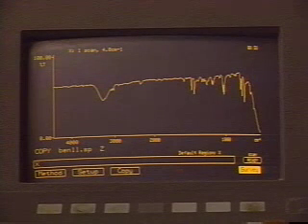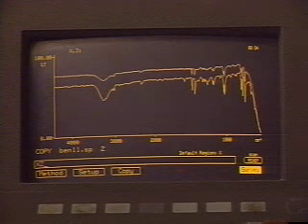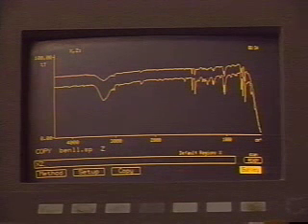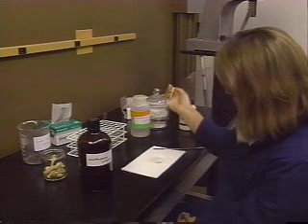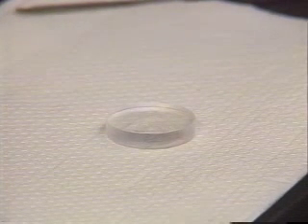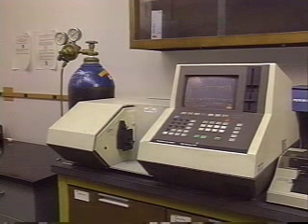This spectrum illustrates a proper thin solid film. If the concentration of the solid in solvent was too low, a spectrum with low intensities would be observed. In such a case, remove the salt plate from the spectrometer and add another drop of solution to the plate. After the solvent dries, rerun the spectrum on the spectrometer.